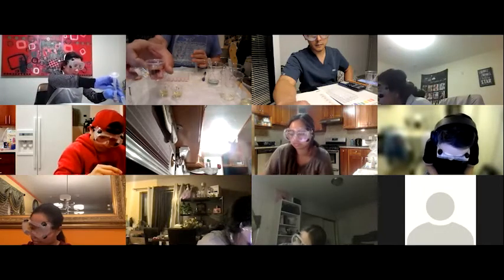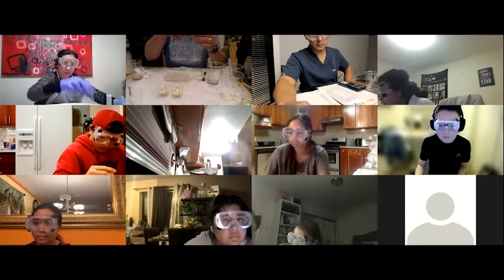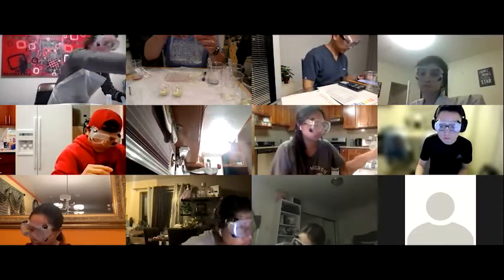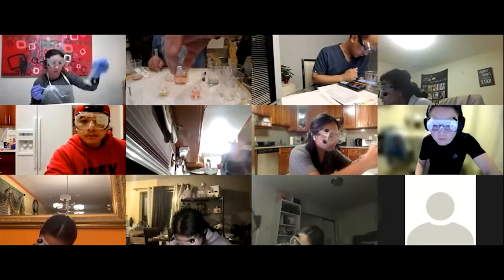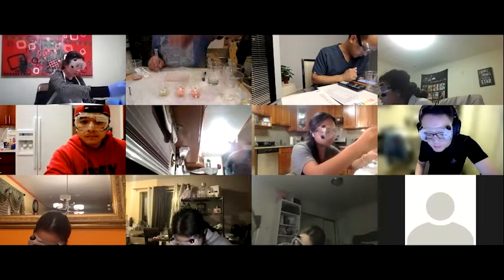So now this is my dilute solution. I want to dilute this one further. So I'm going to take 5 of this and add it to dilution number 2, which again turns pink. Which it should. Even though this is dilute, it's still approximately the same pH. So our color should be the same.